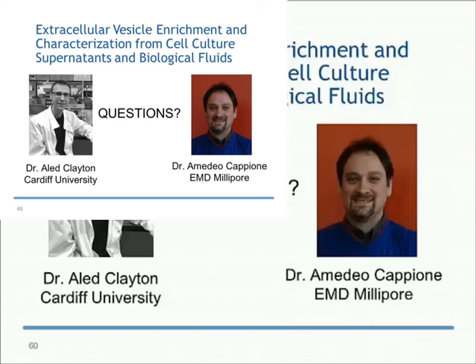I think some beads can be very big. A lot of the immunomagnetic beads that we would use for flow cytometry are pretty enormous. They may essentially squash and damage the vesicles during the magnetic pull down and the wash step. So there's a danger in harming your vesicles and bursting them open. Again, that would change their function.